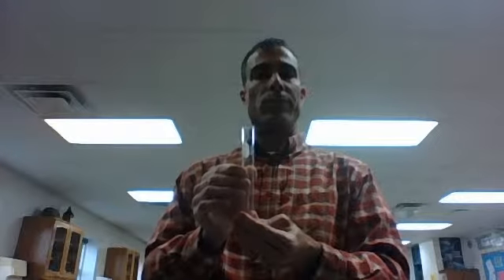Next, we have a test tube. Used for holding liquids. You can do chemical reactions here with liquids and solids and powders and things like that. But this is a test tube, and you need to be careful with these. These are all made of glass so far that I've shown you. So test tube is right here.